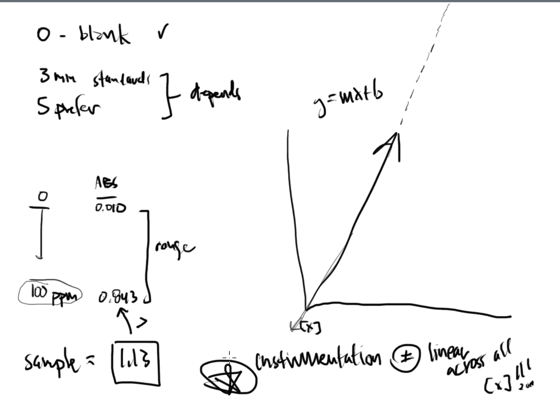Atomic absorption is the same way, another instrument that we use in a lab. If I go over to the AA instrument and I begin to run standards, then the higher I go, I have a chance of getting out of linearity. And what begins to happen is, because the machines can't tell a difference between the really strong concentrated ones, that instead of a line, you begin to see somewhat of a curve. And this is what we call the non-linearity part of the curve.